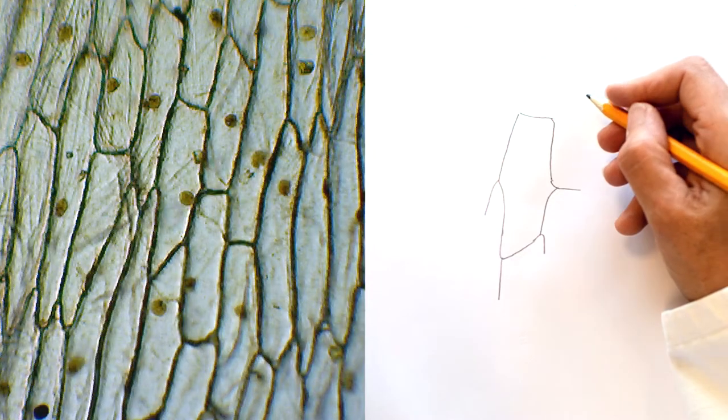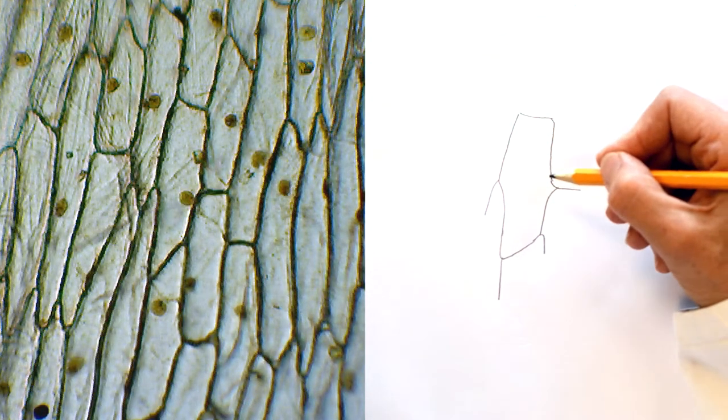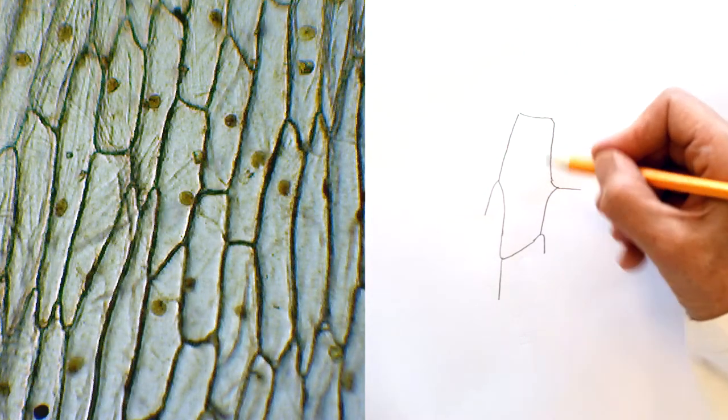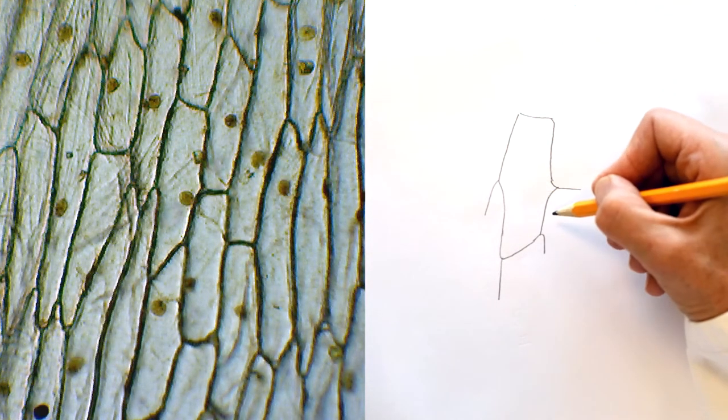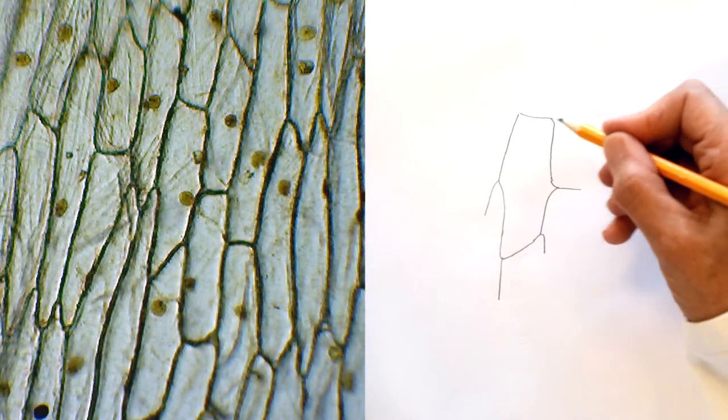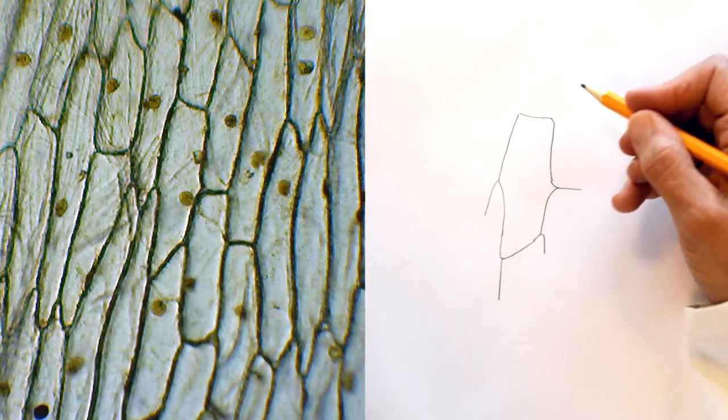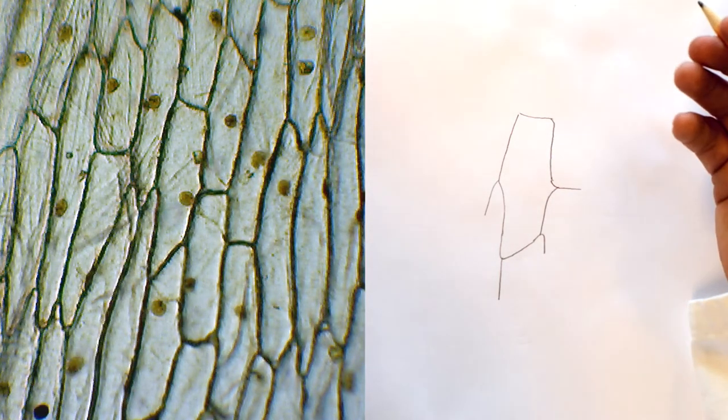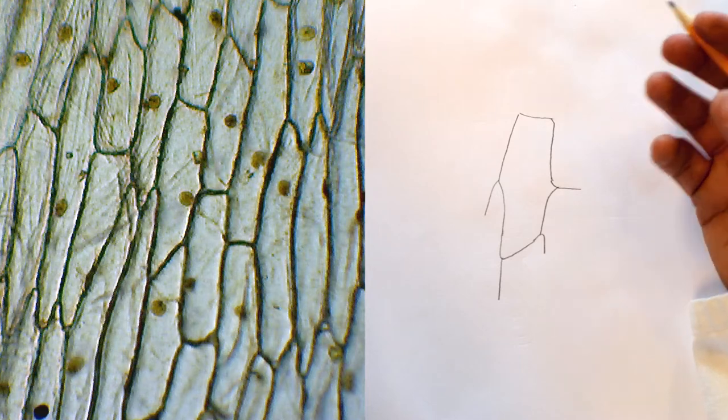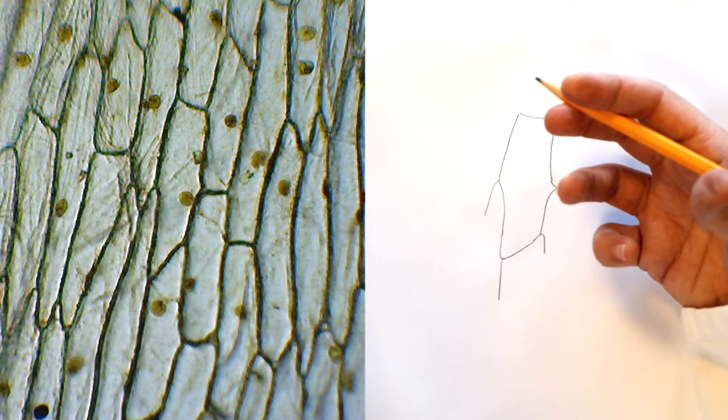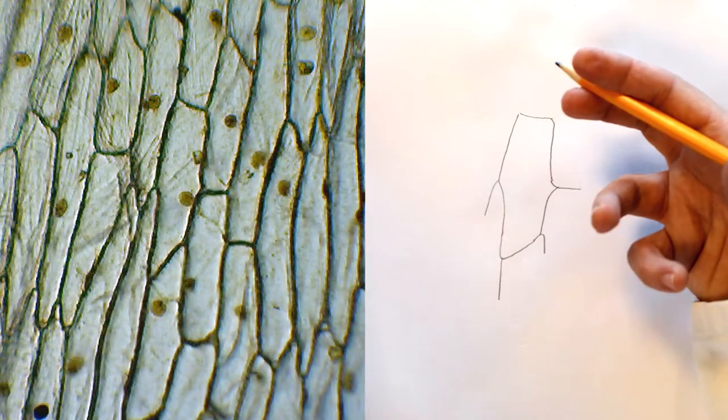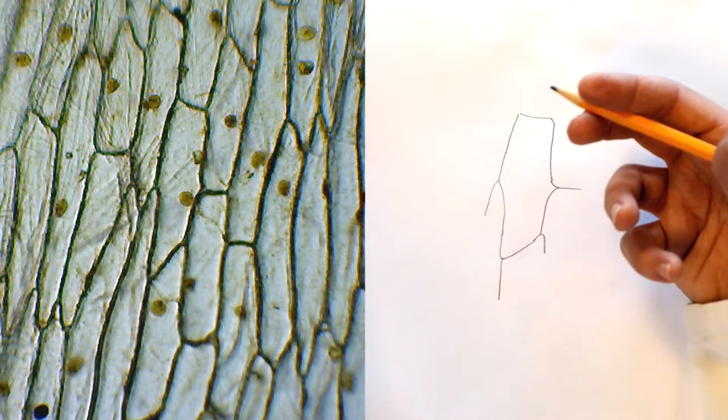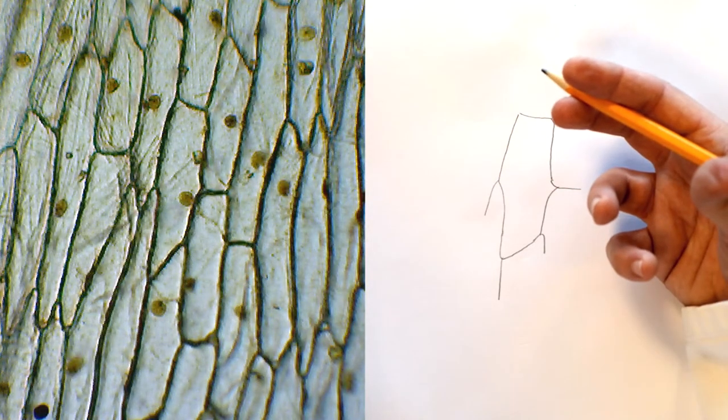So what I've drawn is not a stylised onion cell, I've actually drawn the onion cell which is in the centre of my view. I've actually shown how that cell is interacting with the other cells. Now I'm not going to claim that at this magnification I can see the cell walls so I'm going to leave each cell just with a single pencil line. You might notice something else about my pencil lines. Smooth continuous pencil lines, not sketch lines and no spaces unless there really are spaces. So all of these cells are intact and they're all interacting with each other.